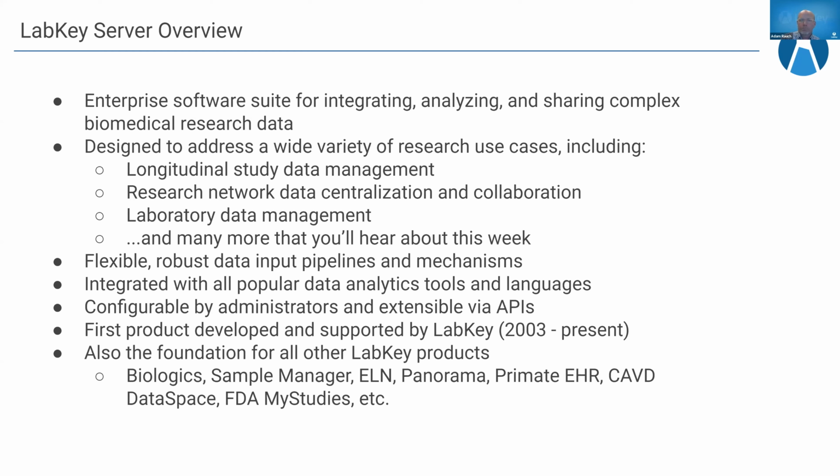And then on a perhaps smaller scale, but no less complex in terms of data management needs, LabKey is oftentimes used within a single laboratory or a series of laboratories to collect all of the data coming from instruments, experiments, and other types of data collection. And then using LabKey to integrate that, again, share it, secure it within that laboratory. There are many other scenarios, and you'll hear about a lot of them on the biologics side, Panorama, and sample management over the next few days.